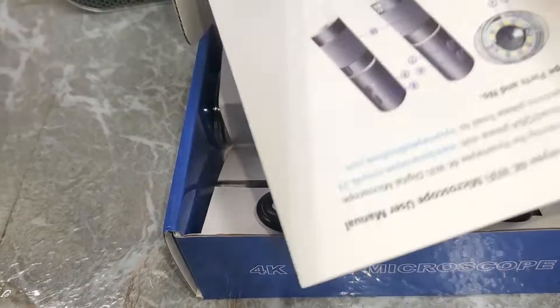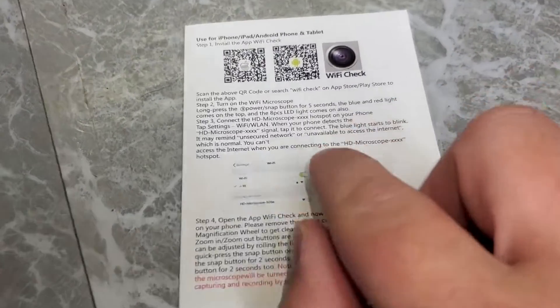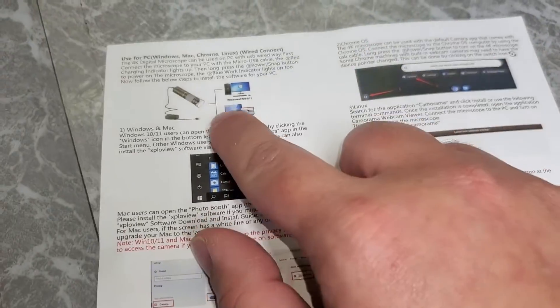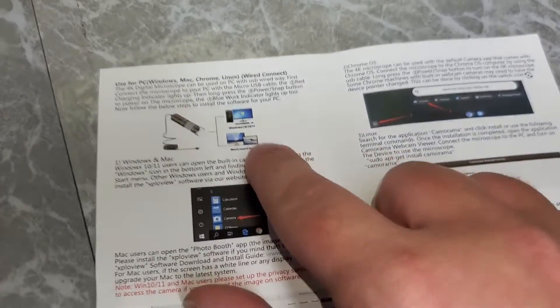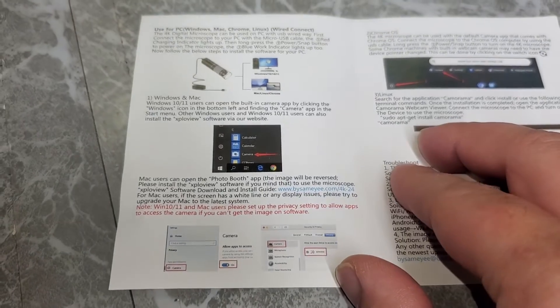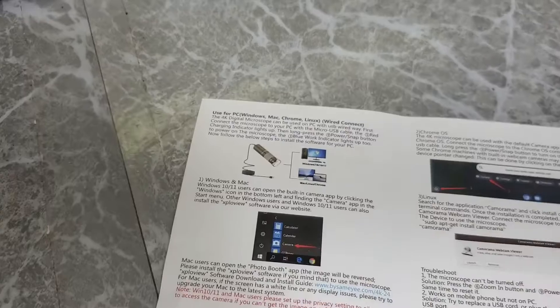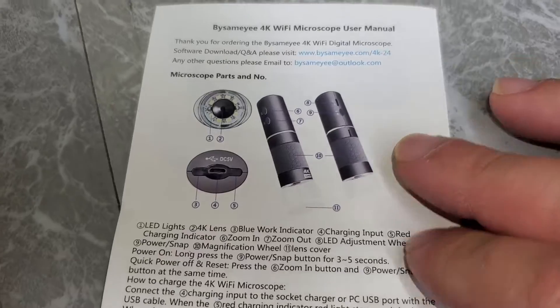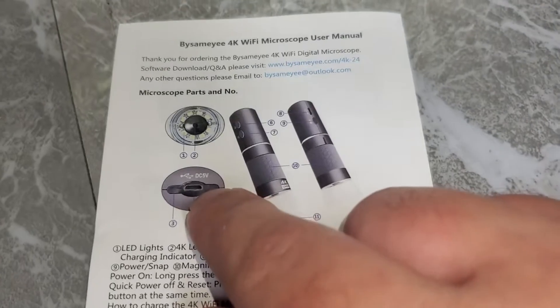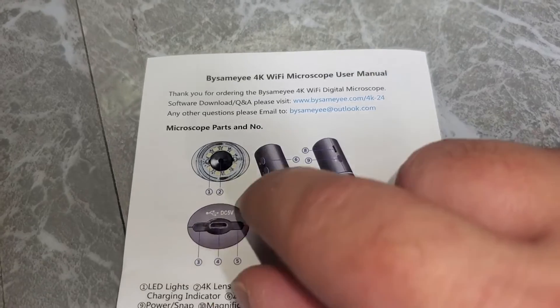Right out of the box there are a couple of QR codes for downloading the app, and instructions showing how to set it up on your phone and PC. The overview of the microscope shows a micro USB port on top for charging and USB output if you decide to use it as a wired microscope, and the microscope lens in the very center.